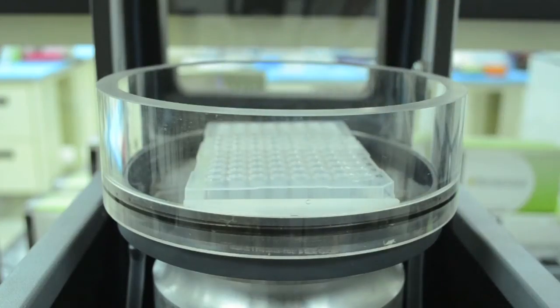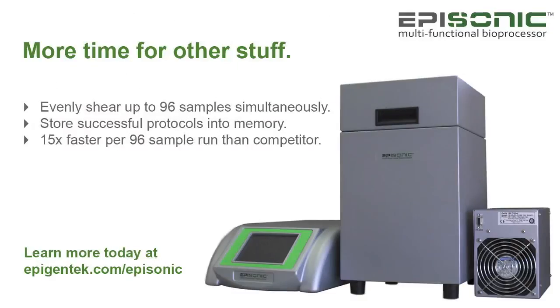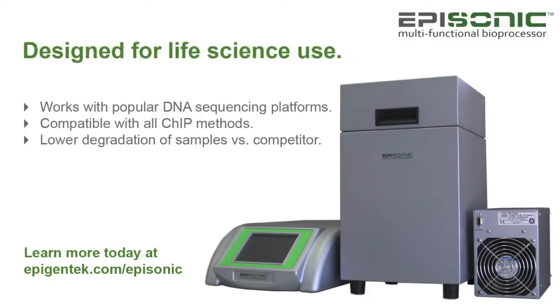You can now repeat the same sonication process as demonstrated earlier. We hope you enjoyed this video demonstration of the Episonic Multifunctional Bioprocessor 1100. Save thousands of dollars per year by using common PCR tubes or plates with the Episonic. Contact a sales representative for more information or to obtain a quote.